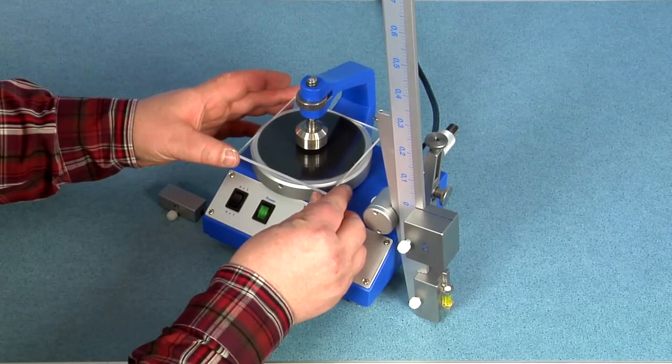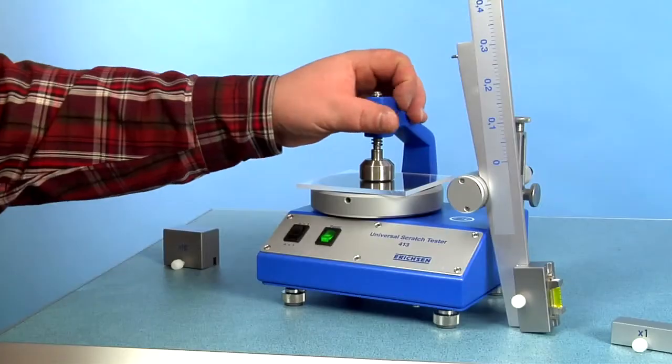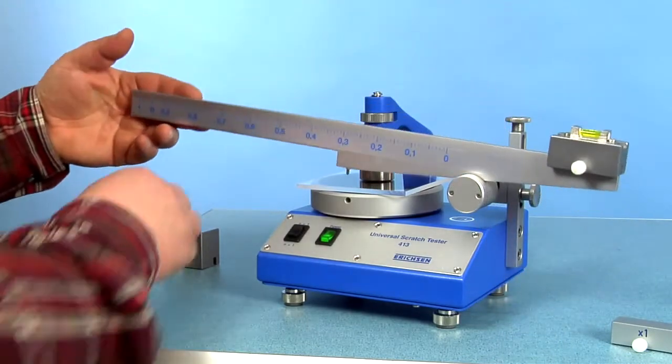The sample is fixed quickly and easily by turning the screw. There are several different test tips available.